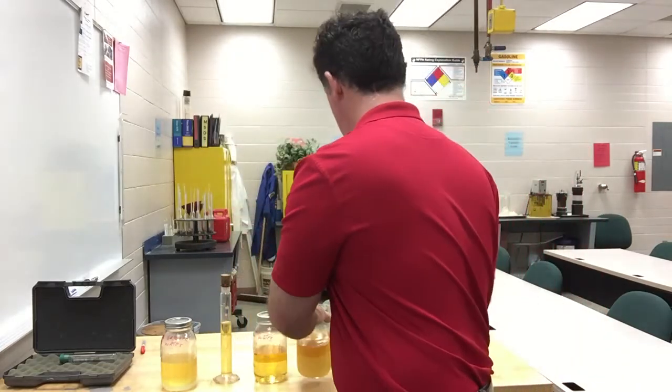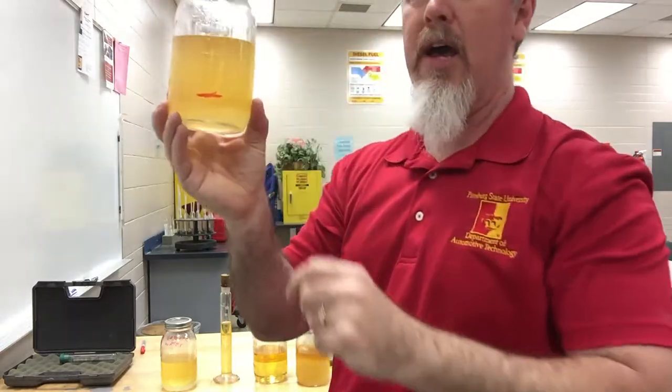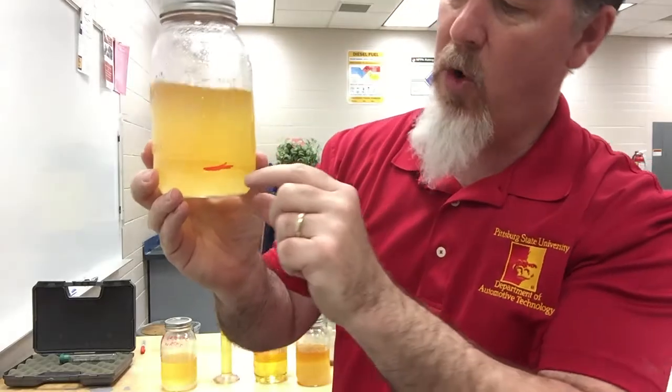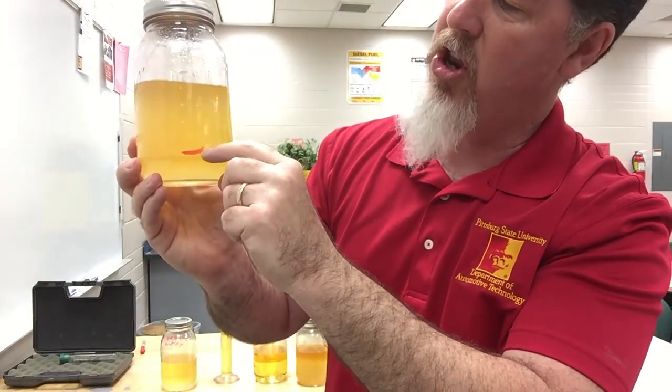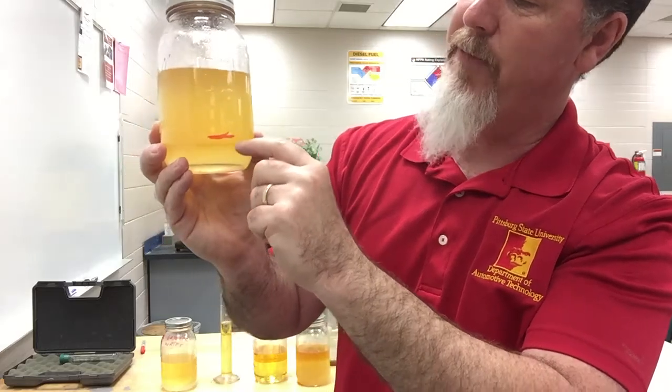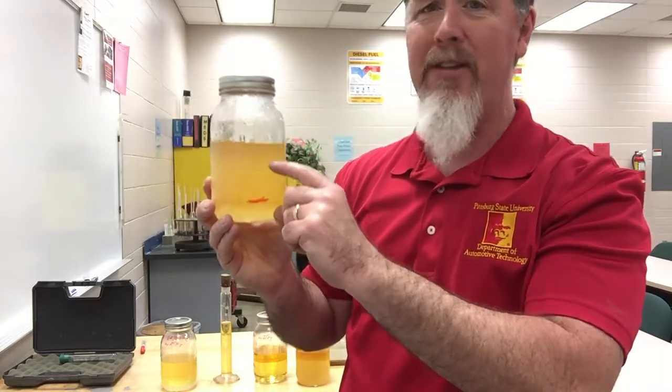If I take a look at my other set, you can see my line. You can see that the water level is pretty much where it was at. It didn't really change. It didn't go up. And so is there alcohol in that fuel? 1%, 2%, 10%. I'd have to have this settle a little bit in order to get a precise measurement. Again, I'm not really caring.